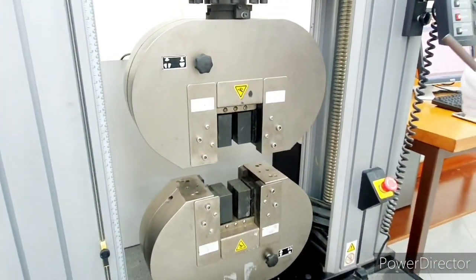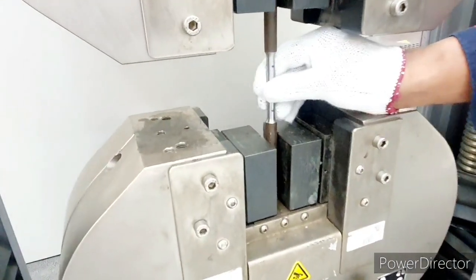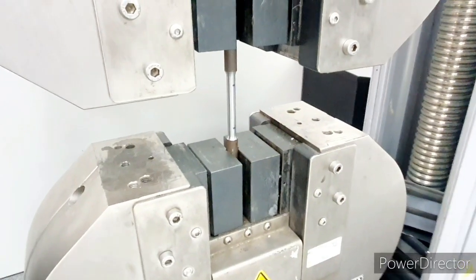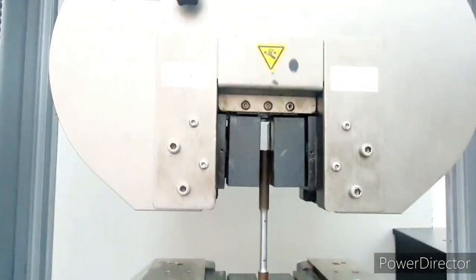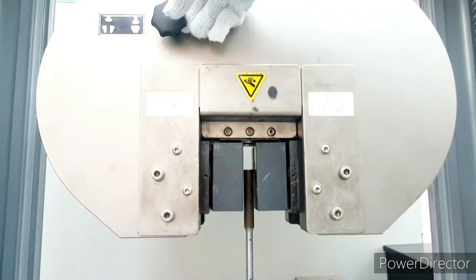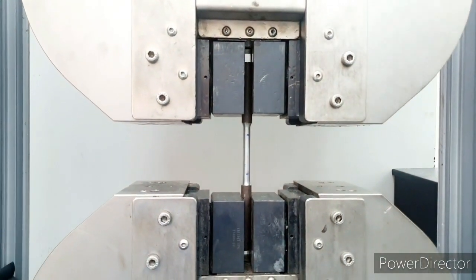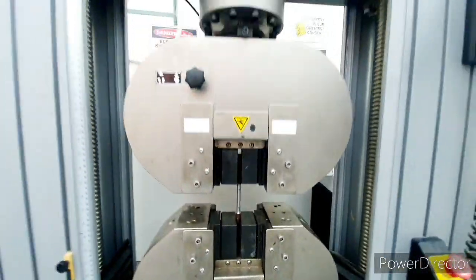Now we will mount the sample from the circular area of the sample here, and then we will pull this button, and the sample will be gripped in our machine from the bottom. You can see that. In the same way we will pull the button on the top and grip the sample from the top. Okay, good. Now we have our sample ready and gripped inside the machine, and it is ready to be pulled to make it a tensile test.